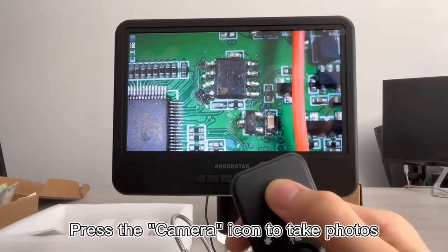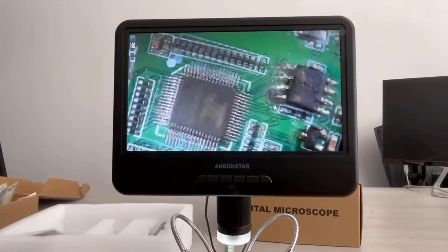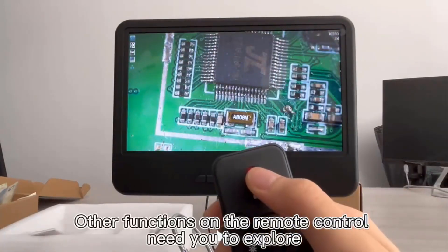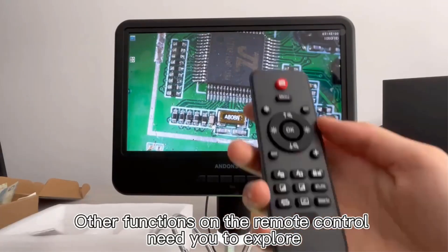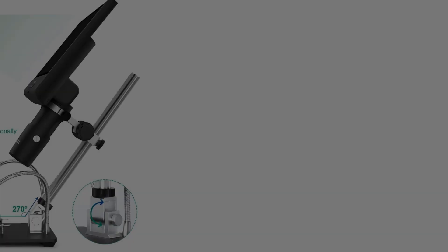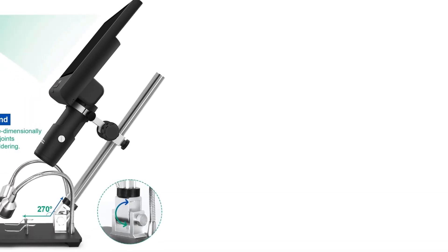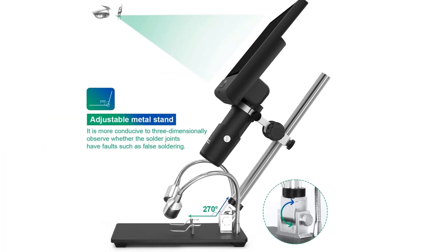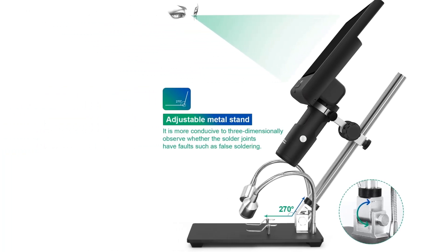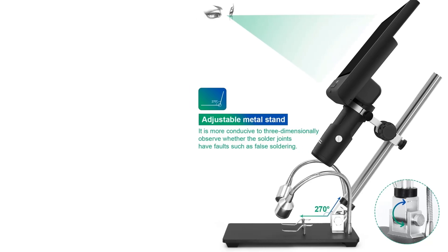The microscope's adjustable metal stand provides enhanced flexibility for multi-angle observation, while integrated LED lights ensure clearer images. The device allows for recording and image capture via a memory card, up to 128g (not included), supporting a wide variety of applications including antique identification, textile inspections, and plant observation.